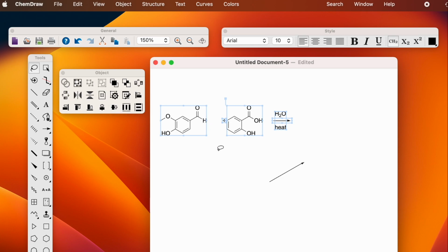So now everything's centered. Now when I drew this, the plus was kind of awkward and in the middle here. So I want to try to align everything horizontally, but these two objects are different objects. So if I line everything horizontally now that's no longer over the arrow. So I'm going to undo that.